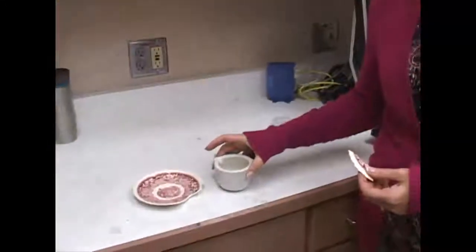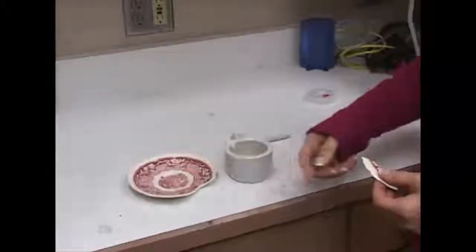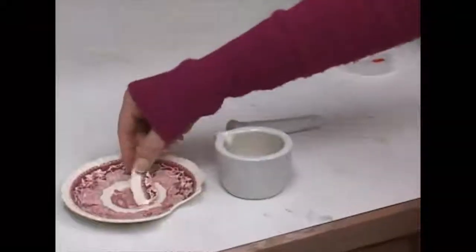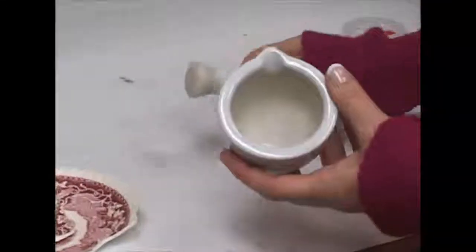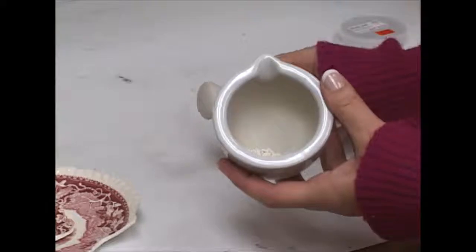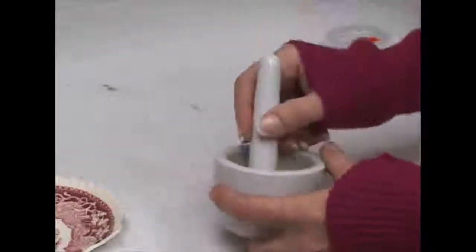I can't just put this in the machine and measure it as-is — I have to actually prepare the sample. X-ray diffraction can be considered a non-destructive test, but in this case it's obviously destructive since I have to break the plate. I break the pieces off and then I need to get that 45 micron or less particle size, so I put those parts into a mortar and pestle and crush them up.